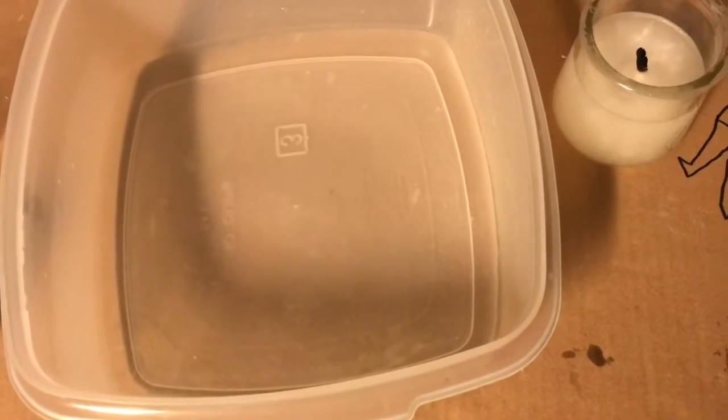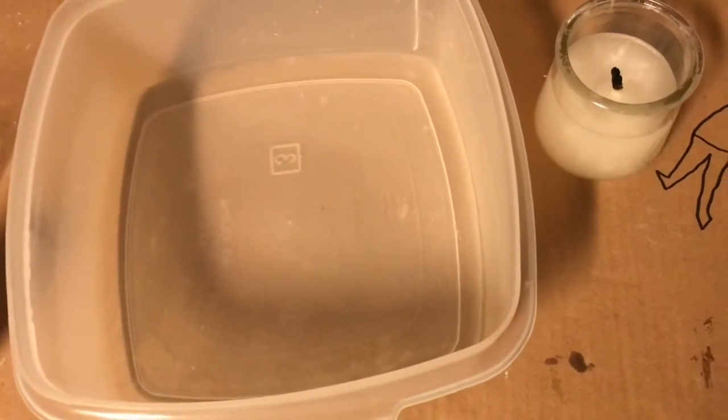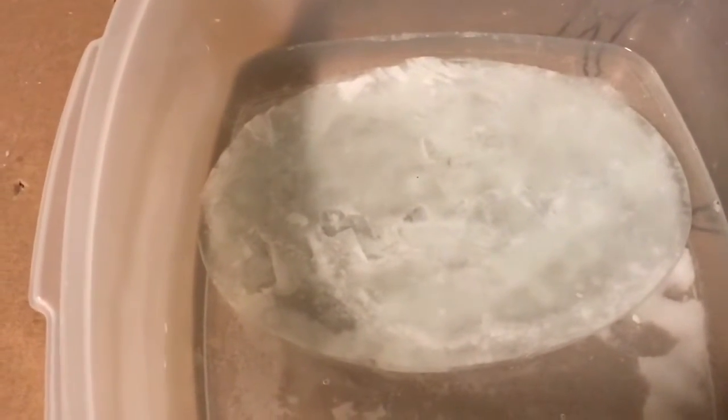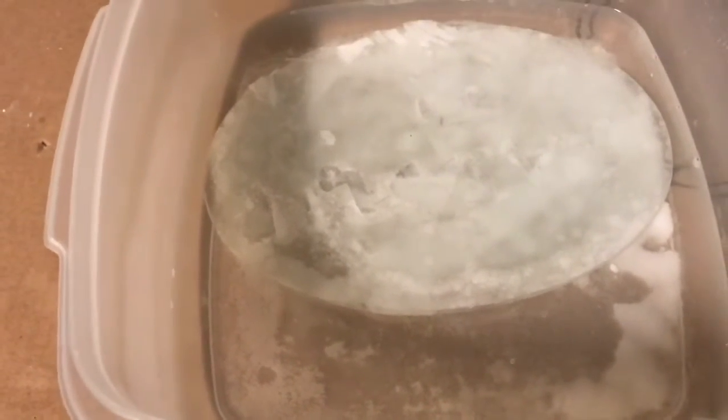Now we're going to put our glass object to be etched in there. I've come back after a couple of days and added some sodium hydroxide and sodium bicarbonate to completely neutralize any hydrofluoric and sulfuric acid that was present.